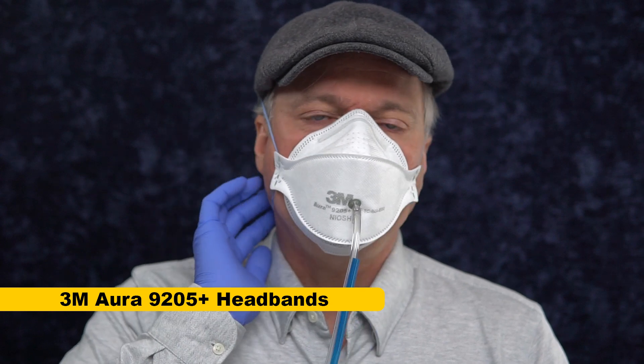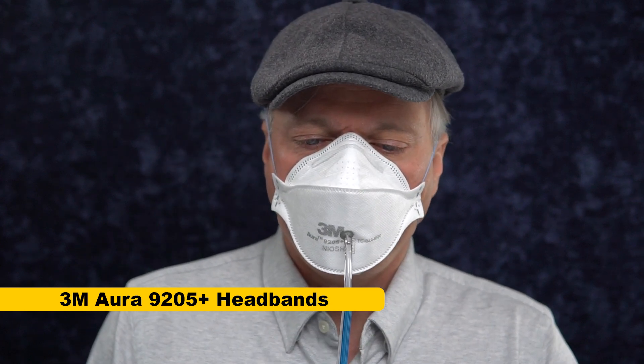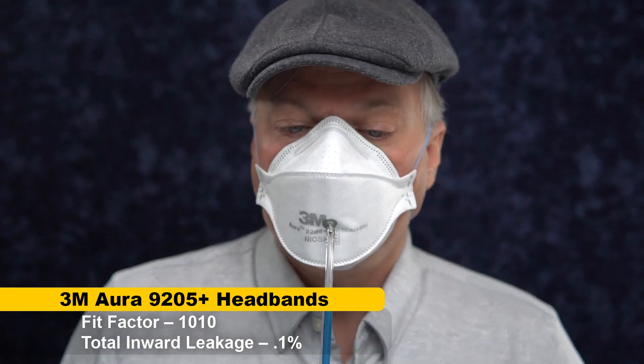This is the 3M Aura with the headbands — that's gonna be our first control, and let's go ahead and give that a test. Wow, that's a really good fit.